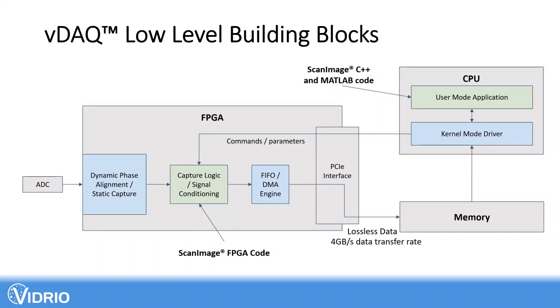Cool. And in terms of the other questions that you said, I don't see a scenario where it would be necessary to pass things directly to the GPU. Am I correct? I seem to remember last time that we chatted, not with you, maybe with somebody else, that you were also looking into voltage imaging, right? To add acquisition. I don't know if it's going to go through the same type of acquisition board or some other type of acquisition. That's definitely a use case that you might want to transfer to the GPU. Okay, that's great feedback. Thank you. No problem. Thanks.